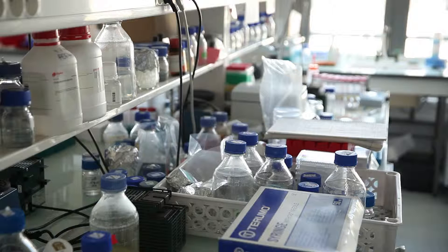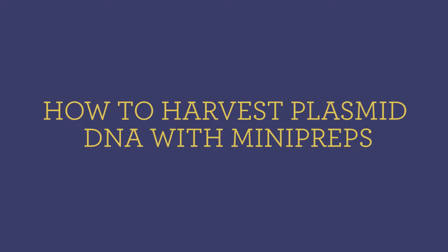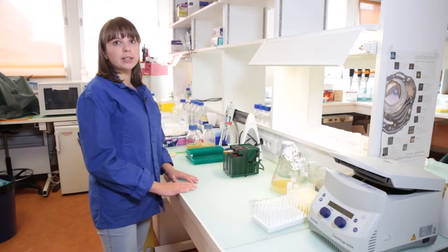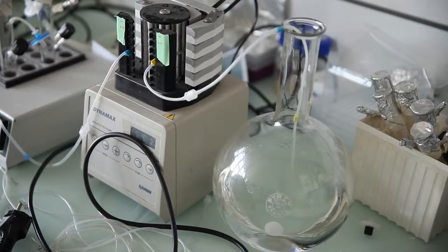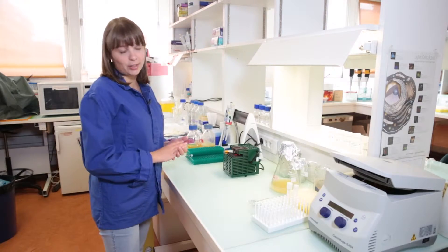Thank you so much for joining us. Today we'll be extracting plasmid DNA from bacteria. It's a protocol that's usually called a mini prep. It's called mini prep because we will be extracting DNA from a small volume of bacterial culture. You can also do midi preps and maxi preps from bigger volumes, but we won't discuss it today.